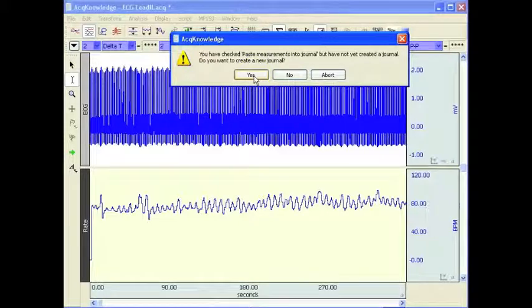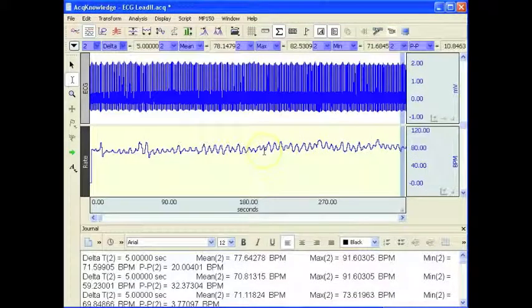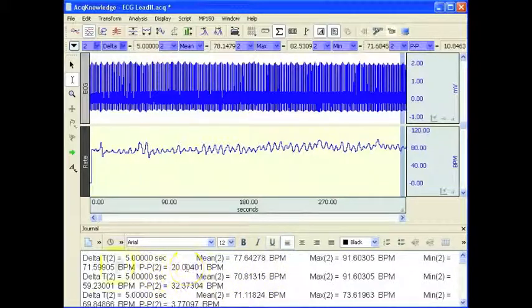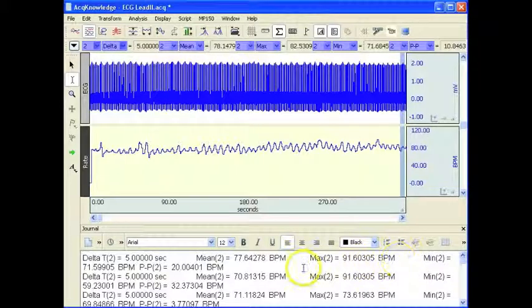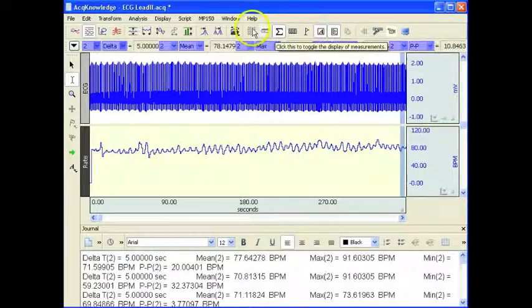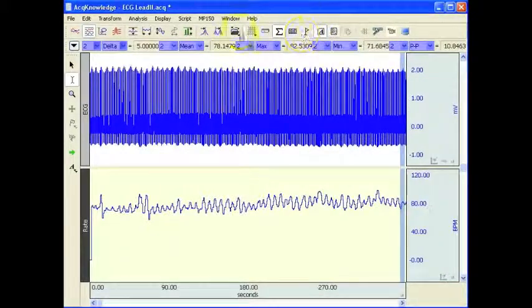I'm going to open a new journal. Now down below, unfortunately because of the scale of the window we're seeing overlap, but these are placed in individual columns. If I expand this window, that might give a better demonstration.